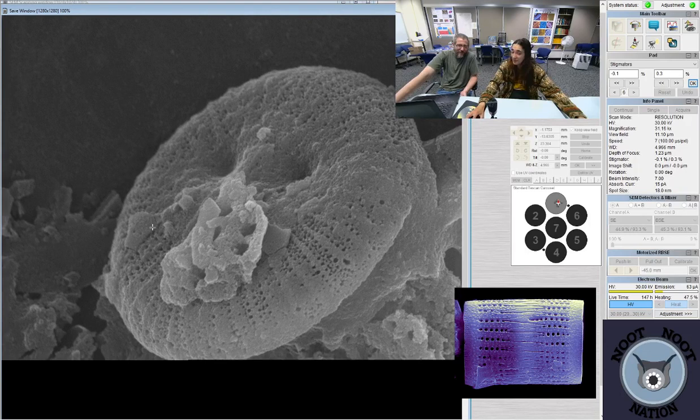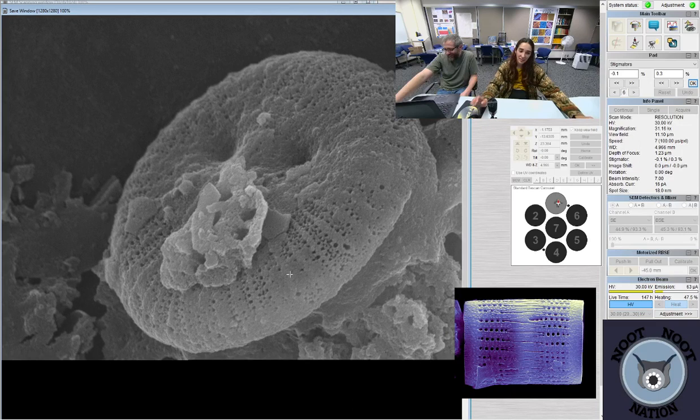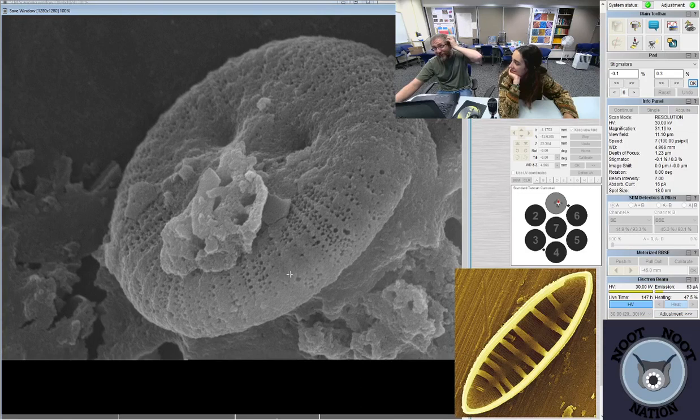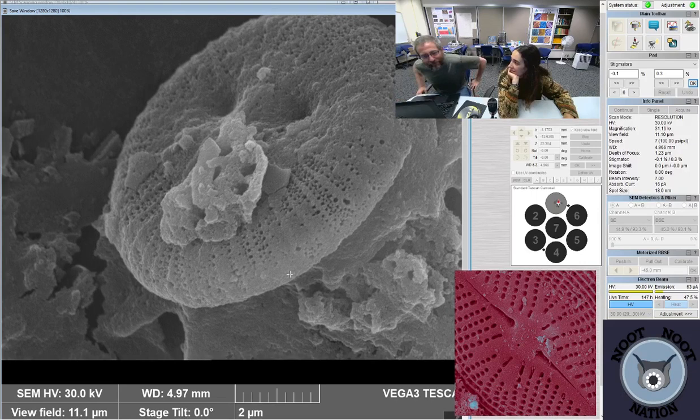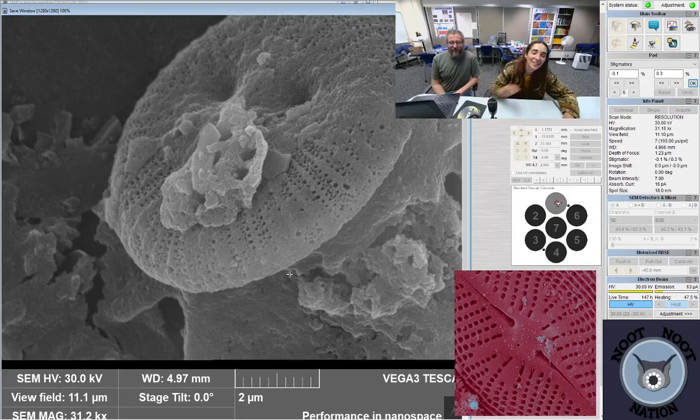I should do a light microscope stream. I usually do one tonight, because I like to do one, and then I send all my people to see Pacific Plankton's stream at the end of my stream. But it means I have to go collect some samples, which means I have to leave the house and go do stuff. Find something interesting. This one's intermedia, right? Oscillata. Yeah.